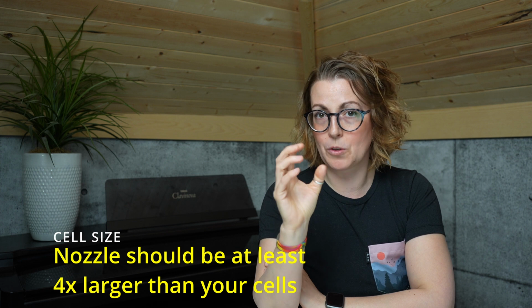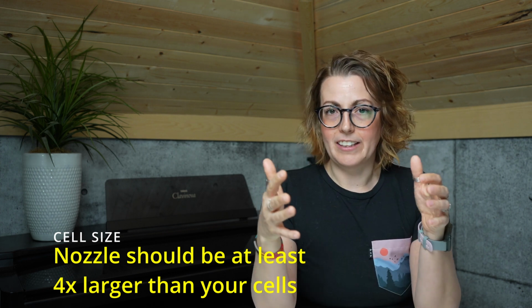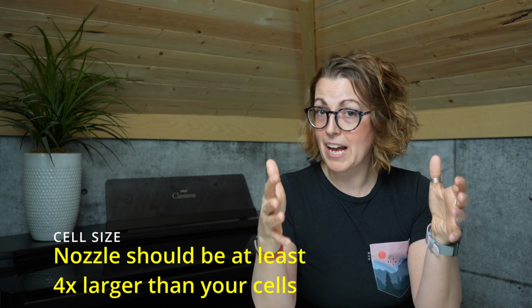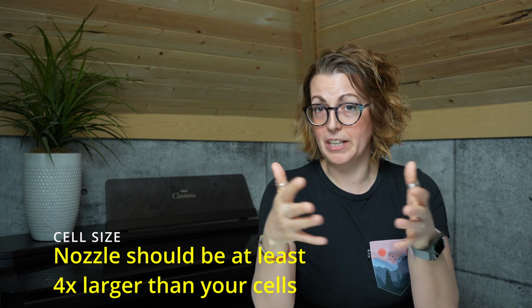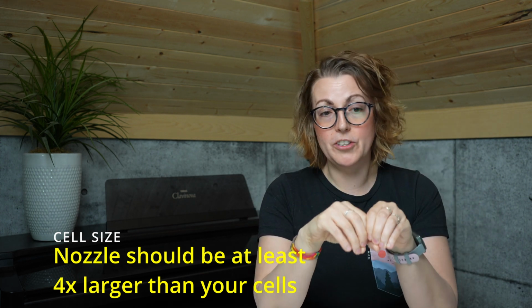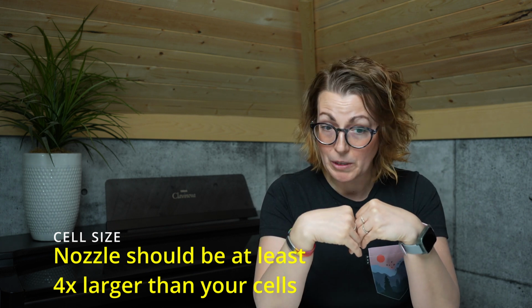Some things to think about when choosing your nozzle size. Number one, determine your cell size, or at least an approximate cell size. Like anything else, a nozzle that is 50 microns can't pass a 51 micron cell through it. It will not fit. The nozzle size must be larger than the diameter of the cells being sorted so that the cells can pass through it.